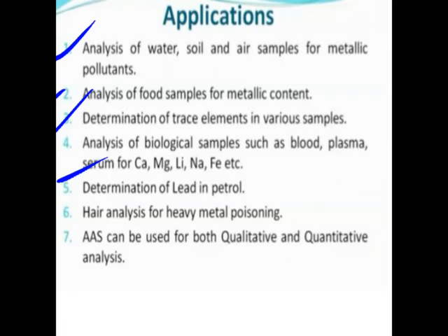Okay, so this is about the introduction. Next we have seen the principle. Third, we have seen the different combinations of oxidant gas and fuel gas, what will be the temperature of flame. Fourth one, we have seen the application. Then we have also seen the difference between the atomic absorption spectroscopy and the flame photometry. Next, we will see the instrumentation which is present in the atomic absorption spectroscopy.